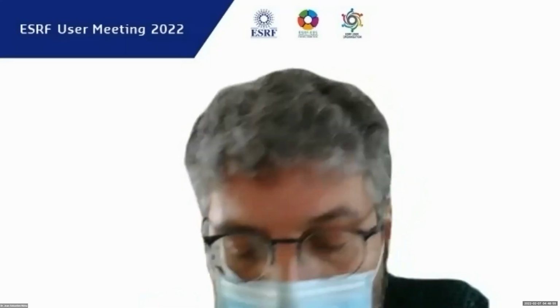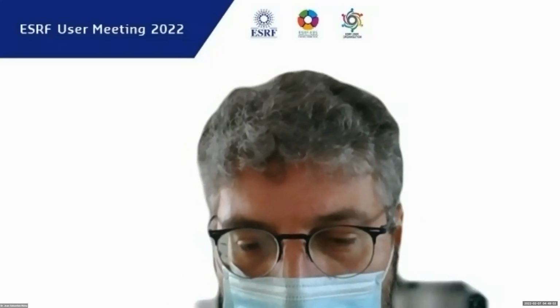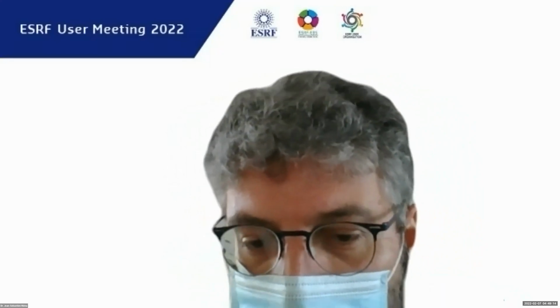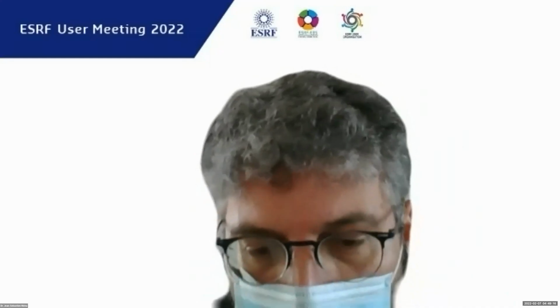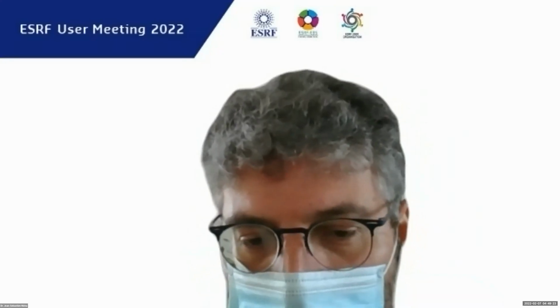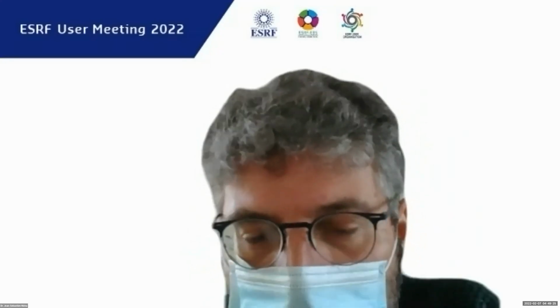We have started the work with Ravi to introduce the neural network. It was because we needed to have a fast tool to index complicated Laue patterns. Complicated means that we have several, 10, 15 Laue patterns that are intricate on a single image. And also we needed to accelerate the indexing of a complicated single Laue pattern with a large number of spots.